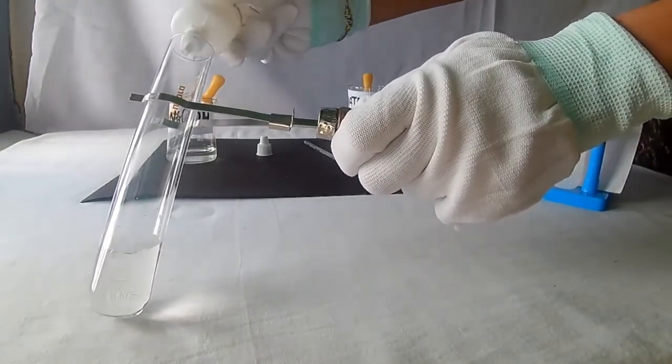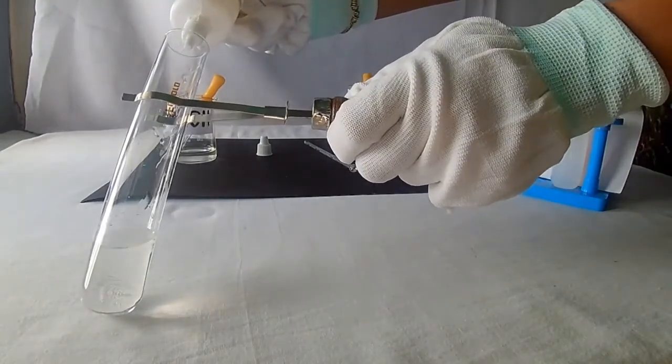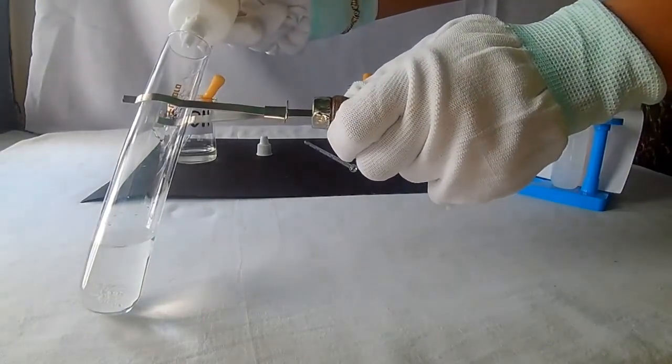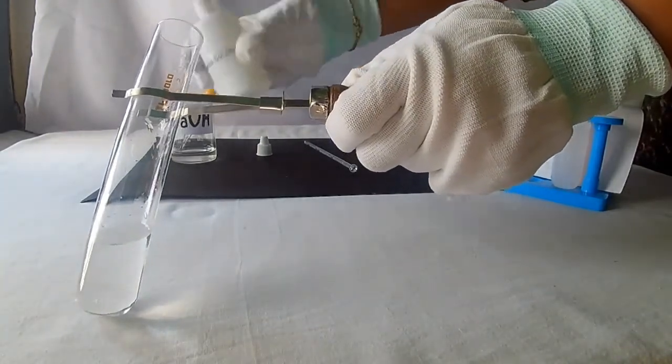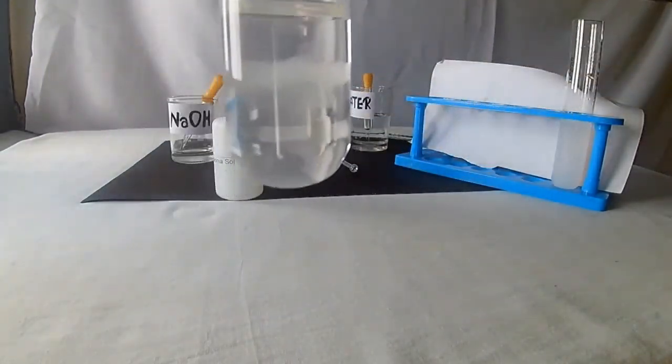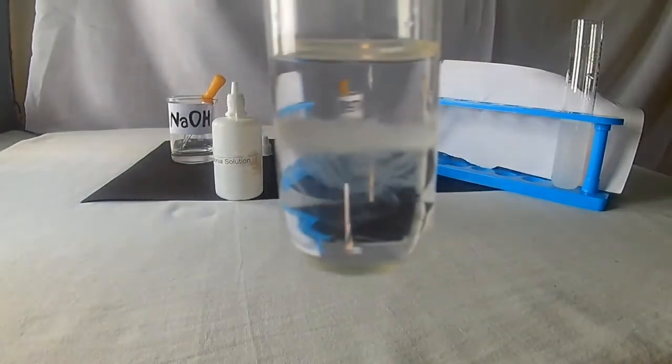Add a few drops of ammonium hydroxide solution to the salt solution. Observe carefully. See, a gelatinous white precipitate is formed.